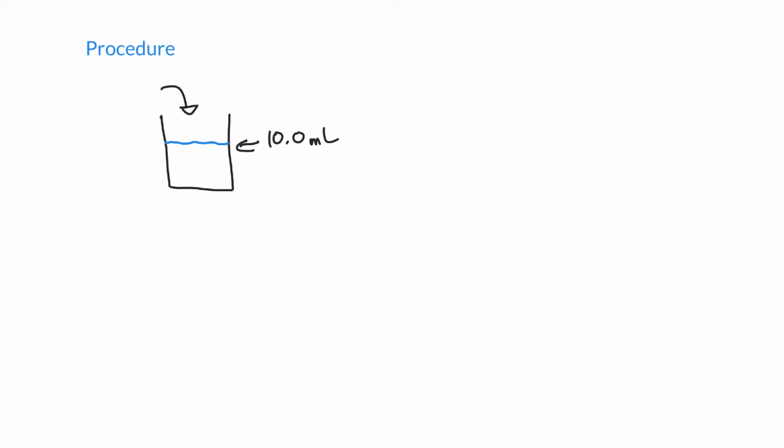If you are a little bit below, you can take a little pipette and suck up a little bit of water into the pipette and drip it in there. And if you're too high, then you can use the pipette to suck some out. So you're going to basically fill it up to the 10ml line. So this becomes your measured volume.